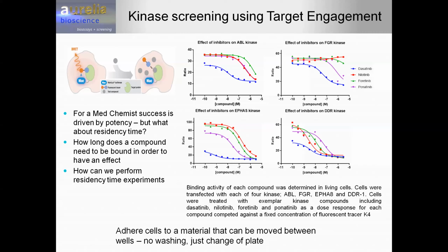The other thing that we can do with this assay is treat the cells with digitonin. By treating the cells with digitonin, we blow holes in the membranes. And what that turns this assay into is more or less a biochemical assay. Granted, the assay occurs in the cells, but there's no barrier for the compound to get into the cells.